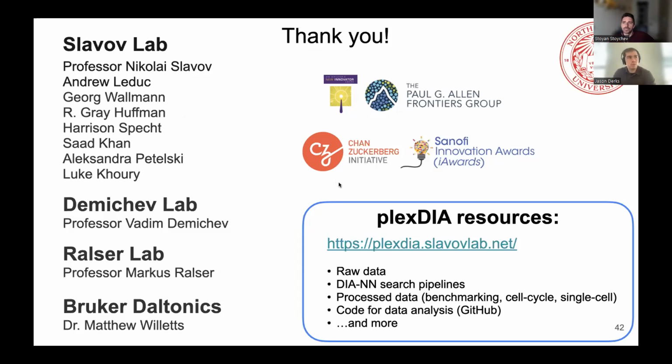Yeah, so what we found is that the MS1 and MS2 quantitation is actually both similarly pretty accurate. If I were to do the MS2 quantitation, I would probably shorten the duty cycle a little bit, just so that you can have more data points per peak and not miss the apex, because that is important for quantitative accuracy. And that is the reason why we did so many MS1 scans for the MS1 optimized method. Which one I would recommend is kind of up to you. I think that they both would work quite well.